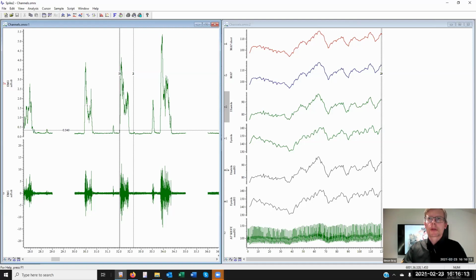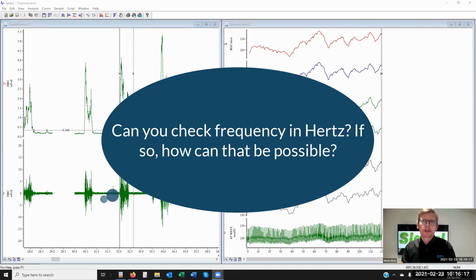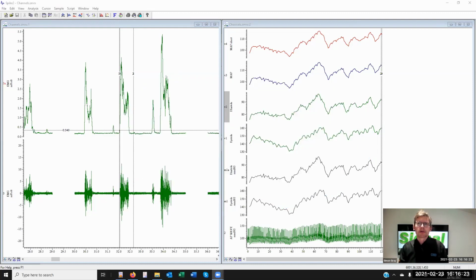Right, another quick question. Can you check frequency in hertz? If so, how can that be possible? Can you elaborate on that, please? I'm not quite sure I follow you. So I'll come back to you as soon as I get a response.